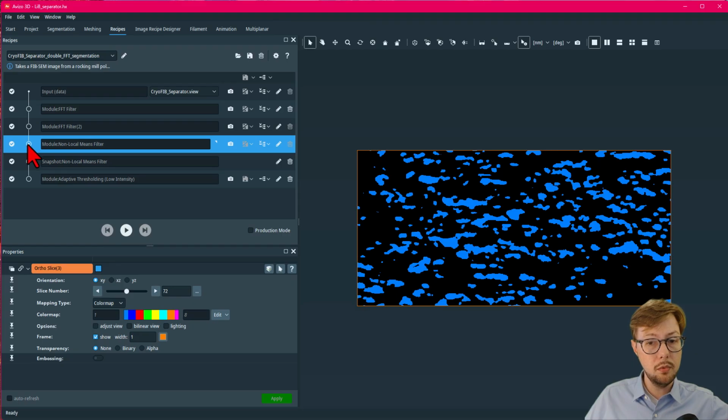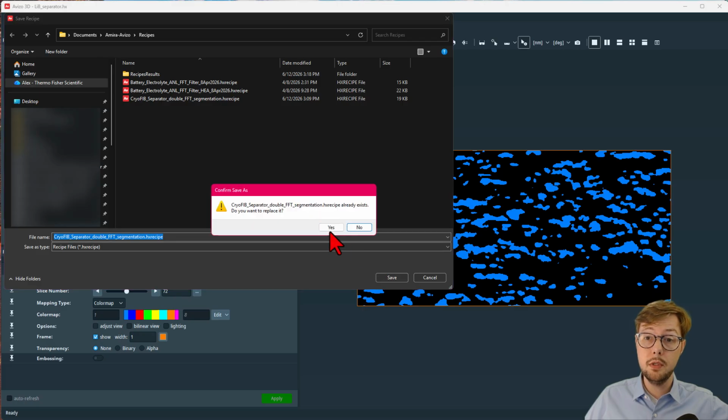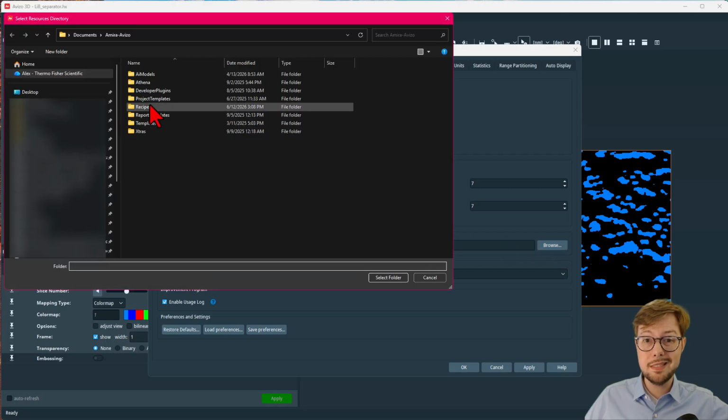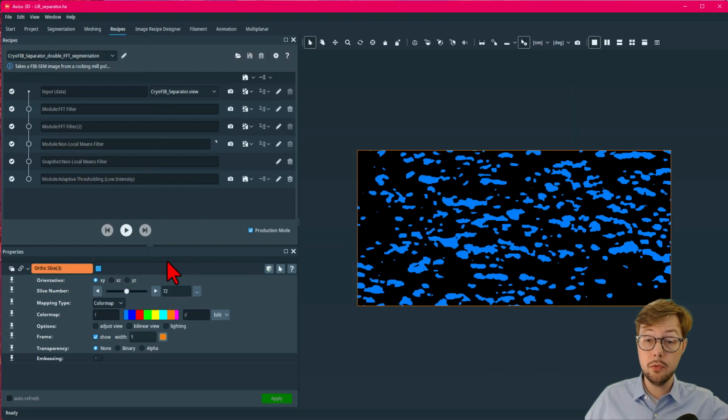In this example, I will remove the break and update my save. An important feature of recipes is enabled by this checkbox. This places the recipe workroom into production mode. When this is checked, results are saved to disk instead of being stored in memory. The directory is relative to where recipes are stored in a subfolder called Recipe Results.